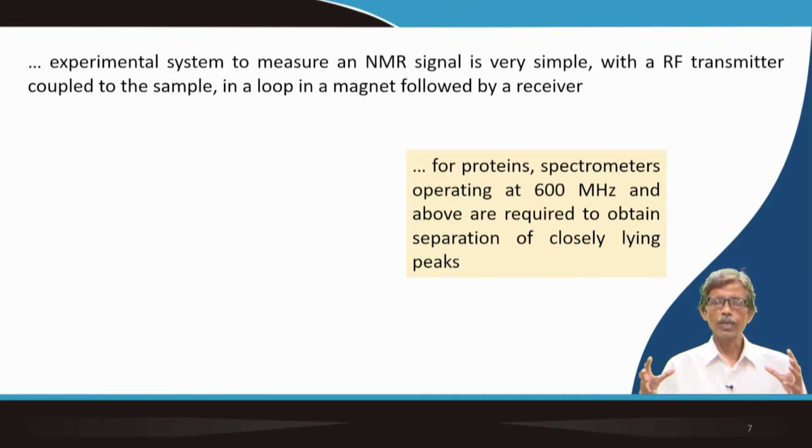Those macromolecules have a large number of CH, NH, COH and aromatic rings, so they all have CH functions. If we try to locate those protons, they give you a clumsy picture, but a strong enough 600 megahertz spectrometer will spread out the entire range.